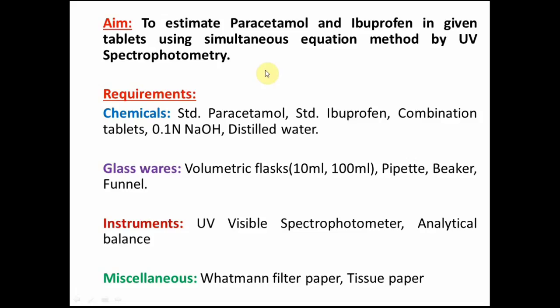Requirements: chemicals required are standard paracetamol, that is API, standard ibuprofen, the combination tablet, and 0.1 normal NaOH in distilled water. Glasswares: volumetric flask, pipette, beakers and funnel. Instruments: UV visible spectrophotometer and analytical balance. We also need Whatman filter paper and tissue paper.